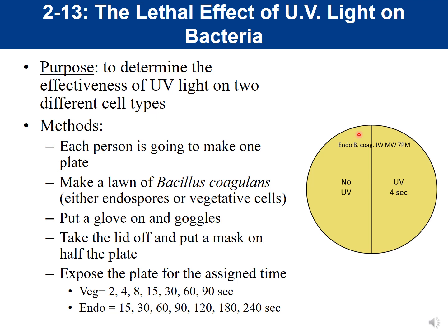Then you would take your plate, turn it over, and put it agar side down so the lid is on top and you're ready to swab your plate. Using aseptic technique, you would take a sterile swab and dip it into the bacterial culture. You would gently push the swab against the inside of the tube to get rid of any excess liquid so the swab is not dripping wet when you transfer it onto the plate. Then you would go with your swab side to side, back and forth, covering the whole plate.